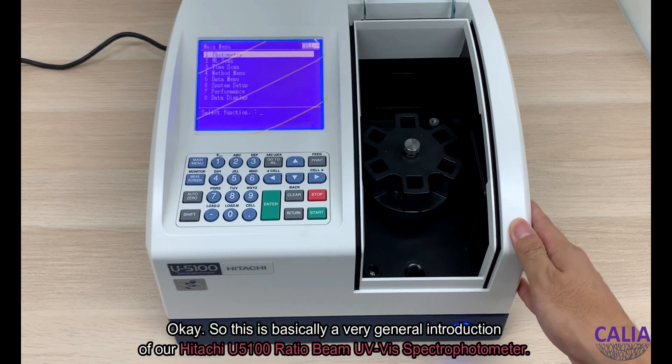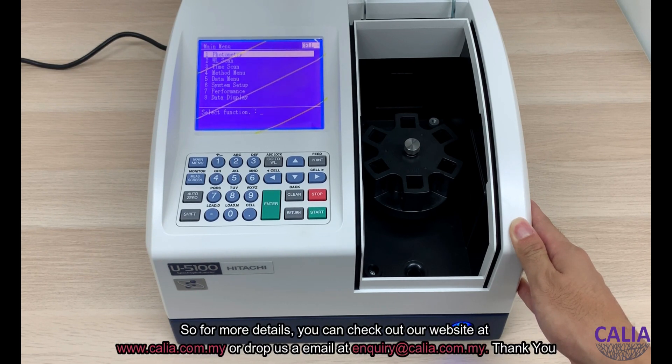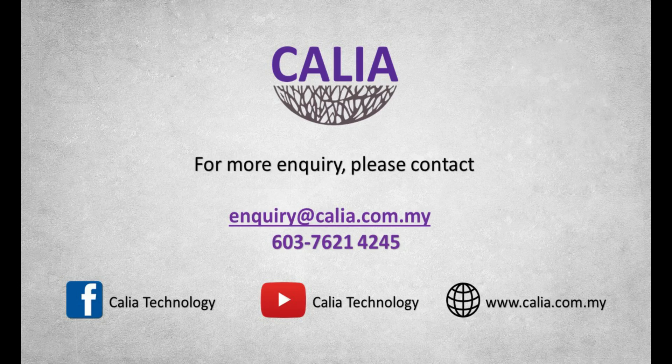So this has been a general introduction of our Hitachi U5100 ratio beam UV-Vis spectrophotometer. For more details, you can check out our website at www.kalia.com.my or drop us an email at enquiry@kalia.com.my. Thank you!